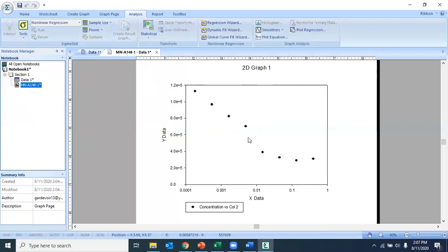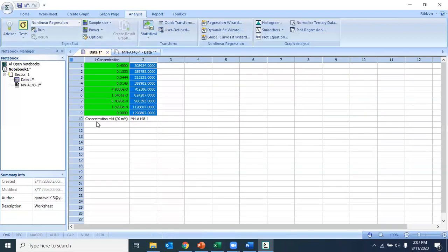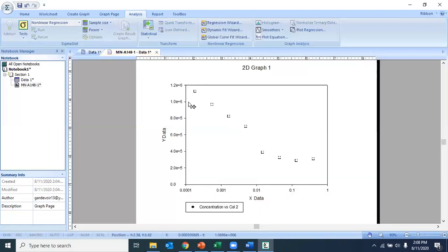So we click to make sure everything is selected, right? You should only see 8 points, right? Because if you think about it, that 9th point, remember down here, the 9th point, it's actually at 0. So it's still included. It's just not shown on the graph because a logarithm can't go to 0, right? That doesn't exist. Some basic calculus review. But we will change that so it does appear on the graph later. That's okay. As long as everything that you see on the graph is selected, it'll be selected.